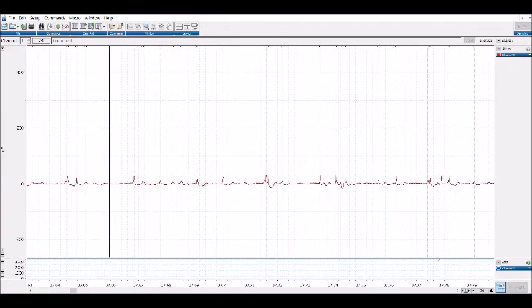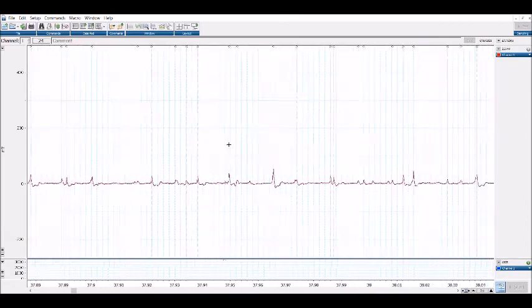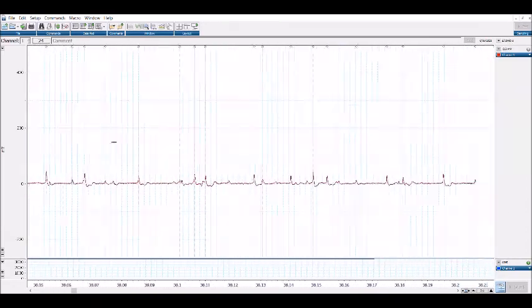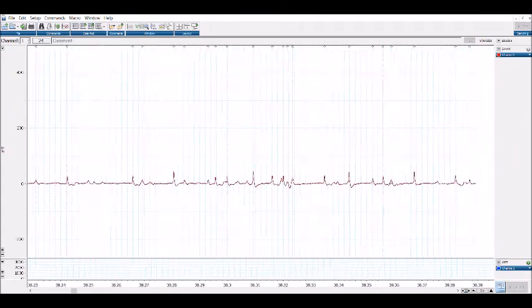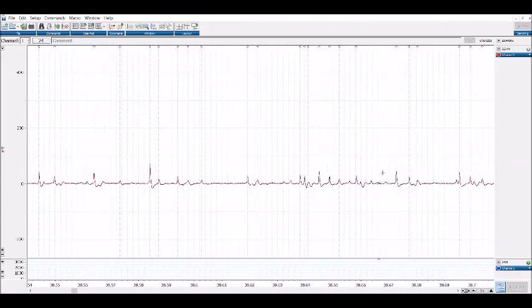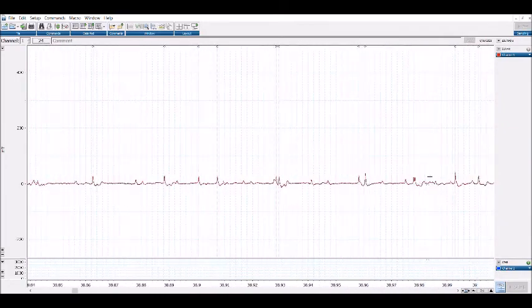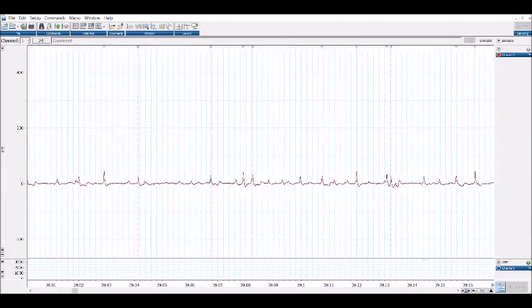So you just go all the way through this. I know this might be getting a little boring, so I'm just going to scroll past this a bit. You get the general idea of what we're doing. So you're going to keep scrolling until you get to 10 seconds. You want to get this 10 seconds exactly at the end here. And you can see when we get to the end, we're starting to get a lot more ones. Like I would want this, and this, and this, and this.